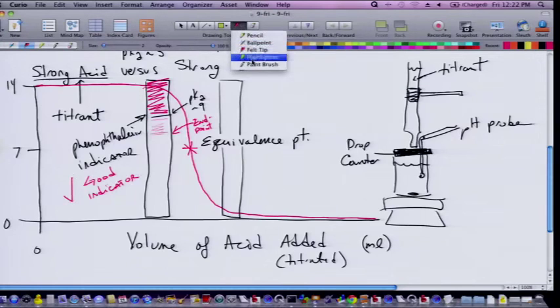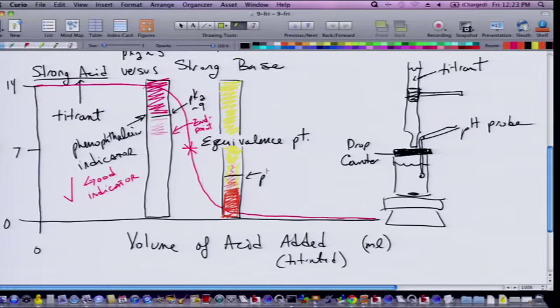Now we can think about another option here, which is the methyl orange. And the methyl orange is going to happen sort of on the opposite end of the spectrum here. But it will actually turn out to be pretty darn good too. And so here's your yellow range here, and then suddenly you transition. And that transition point would be around a pKa of about 5. And so again, in a slightly different way, you'd want to sense when you got rid of the slightest hint of orange color.